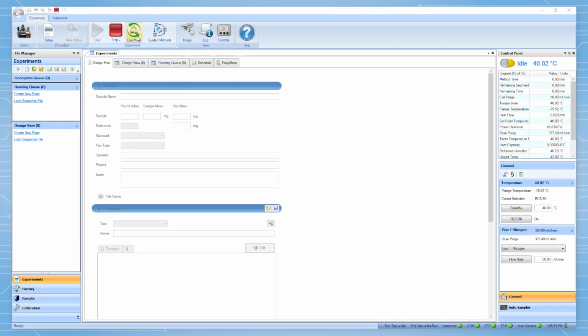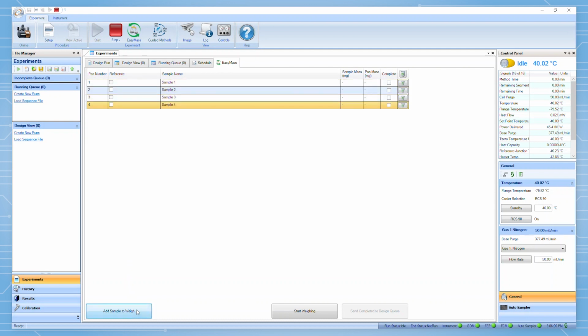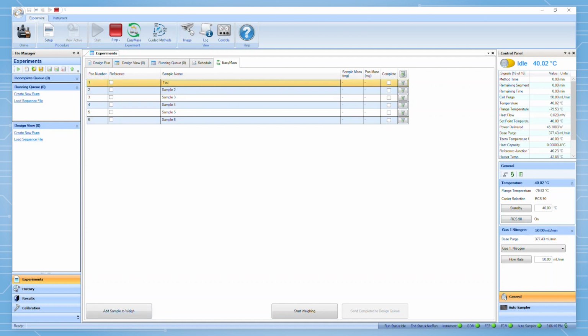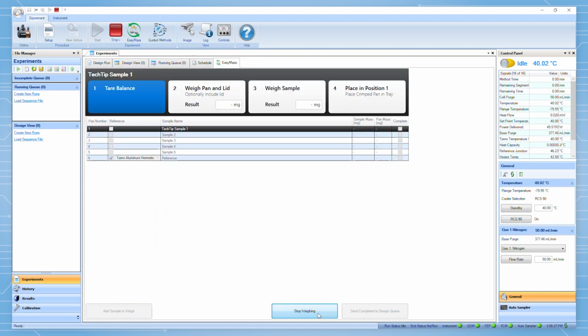Navigate to the EasyMass tab. Here you can add a series of samples or reference pans to be weighed. Click Add Sample and fill in the sample name and pan position. If you are weighing a reference pan, check the reference pan box and enter the pan type. When you are ready to begin weighing, click Start Weighing. A flowchart will appear with the weighing steps for each sample. You can now step over to the balance.